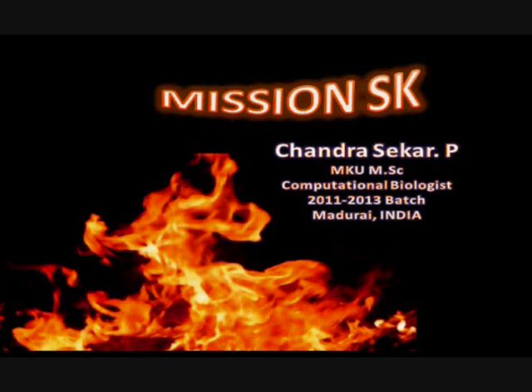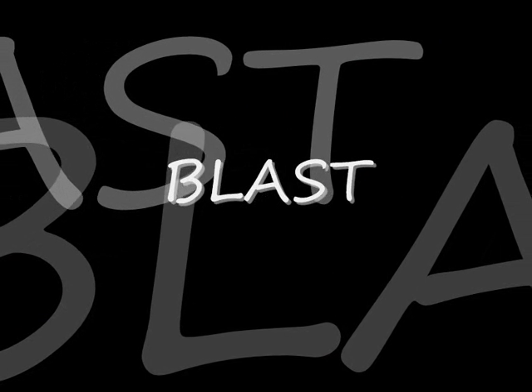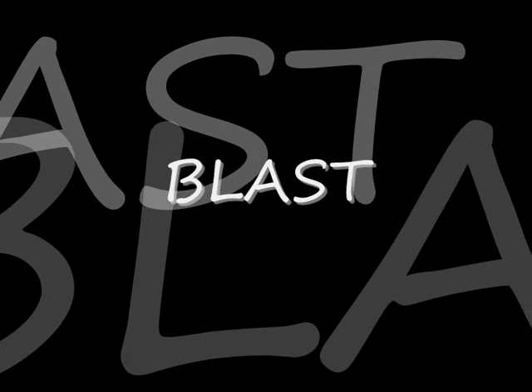Welcome one and all to Mission SK. Today I'm here with an interesting topic, an often pronounced mantra of bioinformatics. Yeah, that's nothing but BLAST.